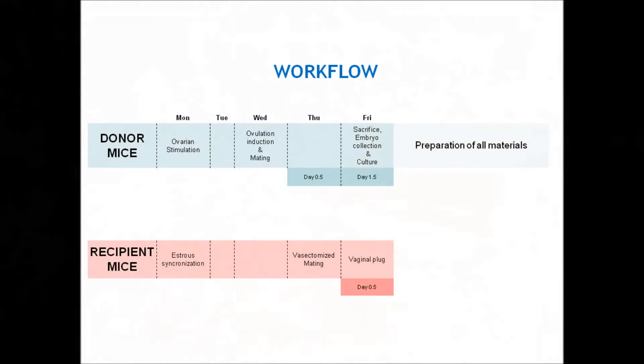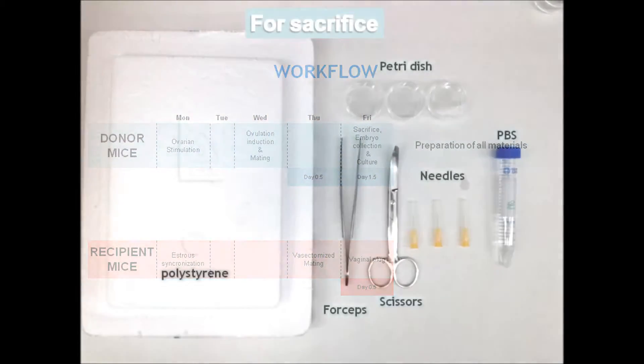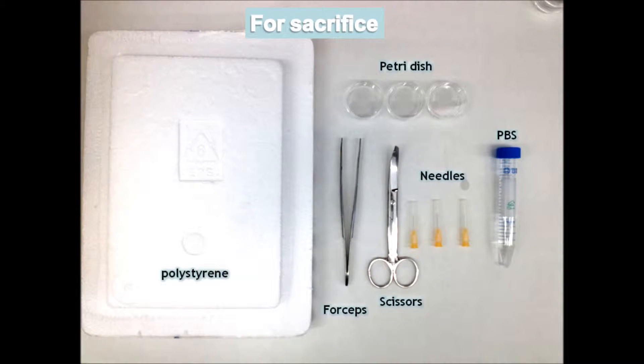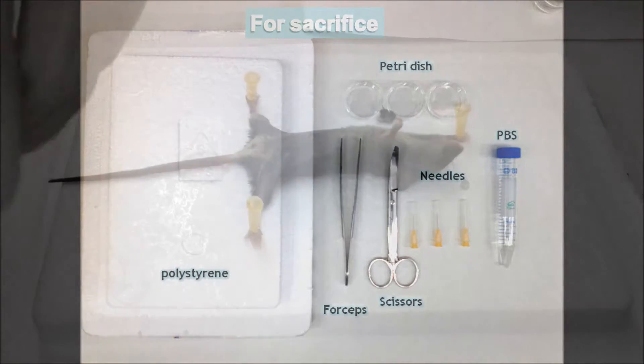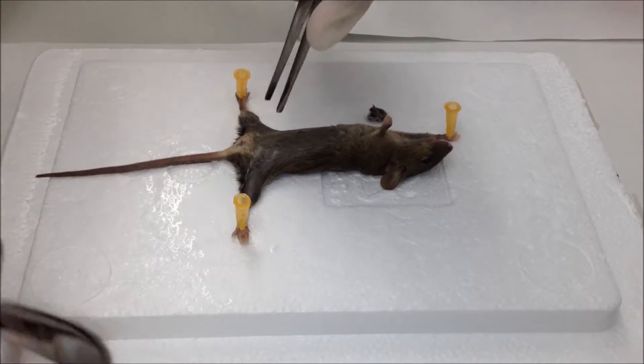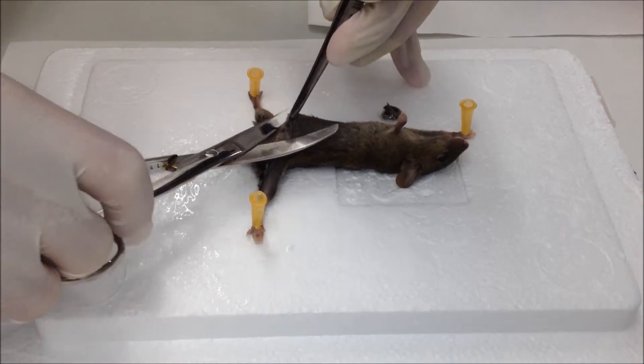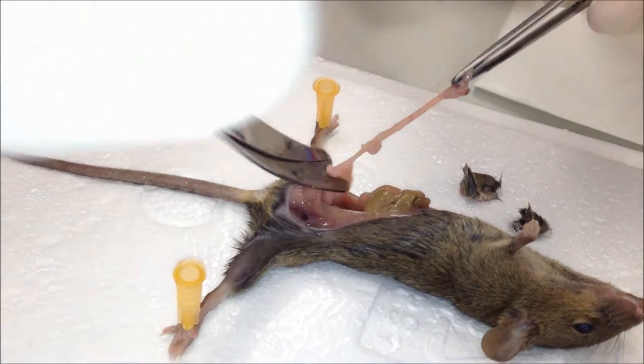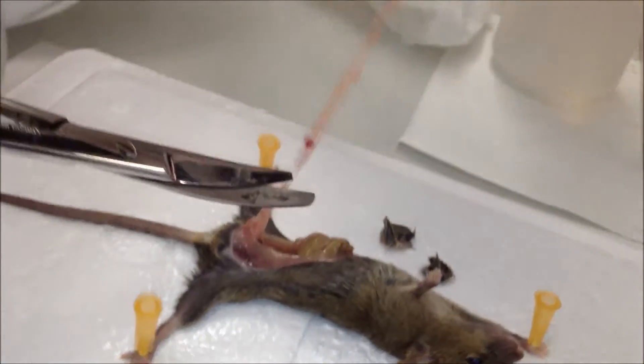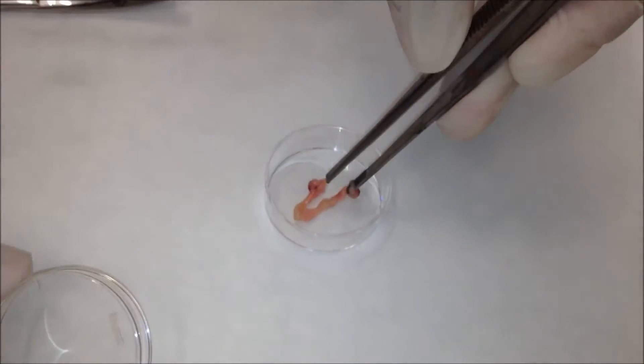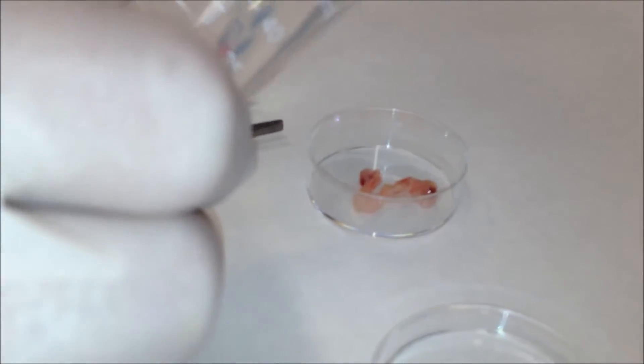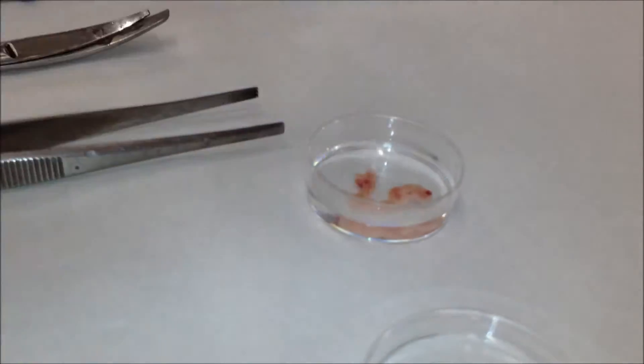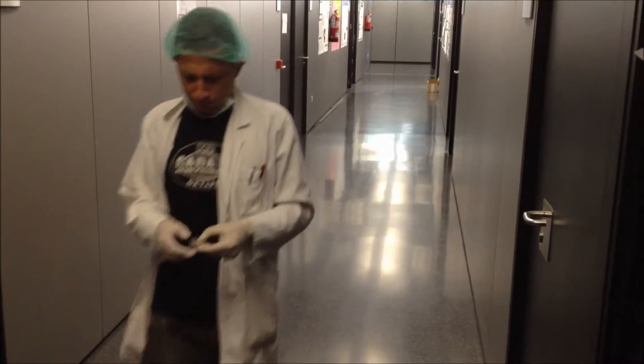The donor mice will be sacrificed on the same day. For sacrifice, we need a piece of polystyrene, forceps, scissors, a petri dish, needles and PBS. After cervical dislocation, the mice are placed face-up. Make an abdominal cut to expose the organs using the scissors and forceps. We will look for the uterus and together with the ovaries, they will be dissected and placed in PBS ready to flush the embryos out.